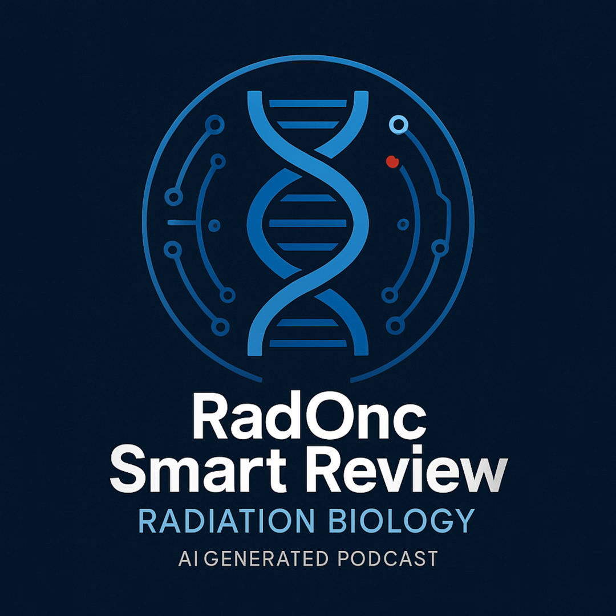Okay, let's shift to techniques that look at how proteins interact with DNA to control genes. Chromatin immunoprecipitation, or ChIP, is a major one here. ChIP is a technique you use when you want to know where a specific protein is physically bound to the DNA inside the cell in its natural chromatin environment. Think transcription factors binding to promoters or repair proteins localizing to damaged DNA. It maps the protein's address on the genome.